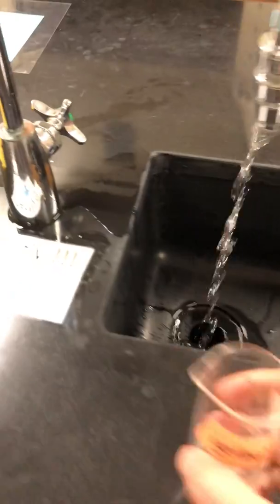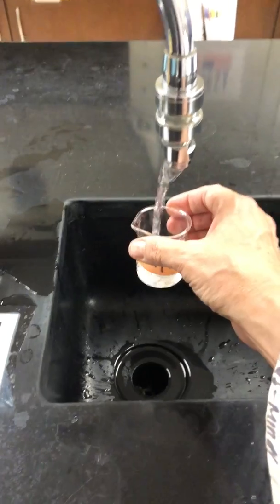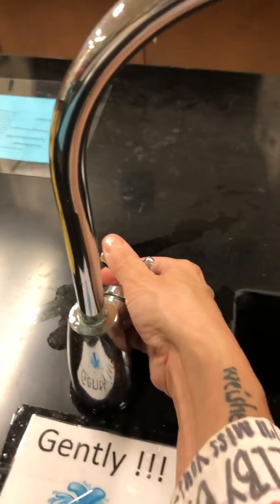So it looks like we're going to do something similar, and yes, we are. We need to get approximately 40 milliliters of water into each of our beakers. You can see they're labeled, so this is going to be just yellow water. Let's get 40. Let's get 40. Let's get 40. Okay.